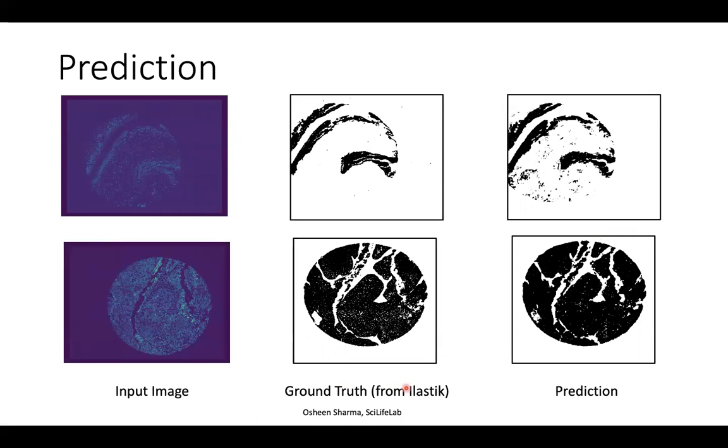And with this, we can conclude that the deep neural network has the capability to use the morphology information to detect cancer epithelial. And this allows us to use this channel of pan-epithelial for any other staining or antibody marker, which will provide other relevant information and will help in microscopic image analysis.